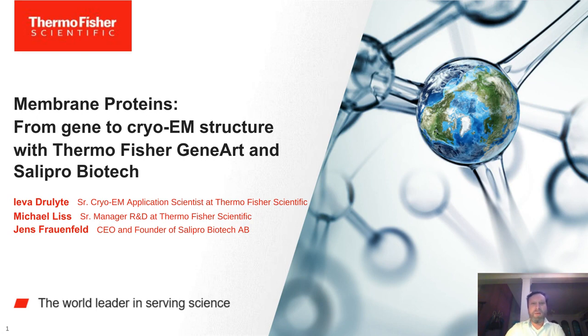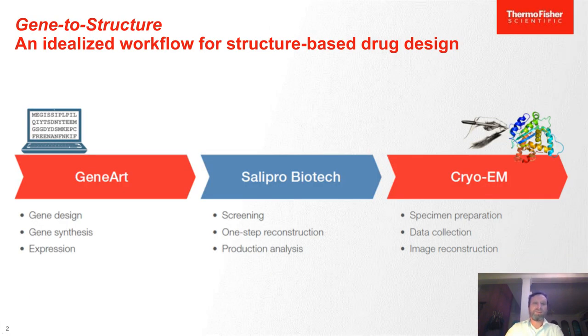So the entire workflow of this procedure starts with gene synthesis. We start at GeneArt with a protein sequence, for example, back translated into DNA and designed for optimal expression. I will explain a little bit later what that is.